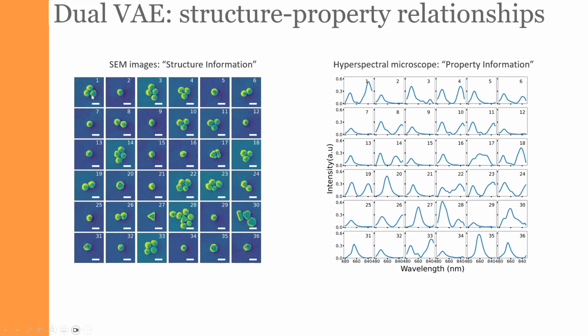We have the images of the gold nanoparticles. So same type of creatures as the indium tin oxide that Kevin has shown. These particles can be resolved in the scanning electron microscope. You see that they are partially agglomerated. So we have trimers, monomers, tetramers, another trimer, monomer, dimer. And you can also see that some of them have different shapes.